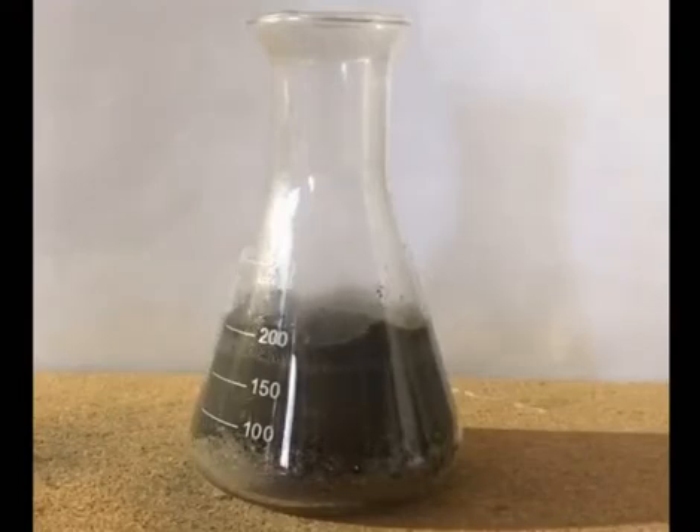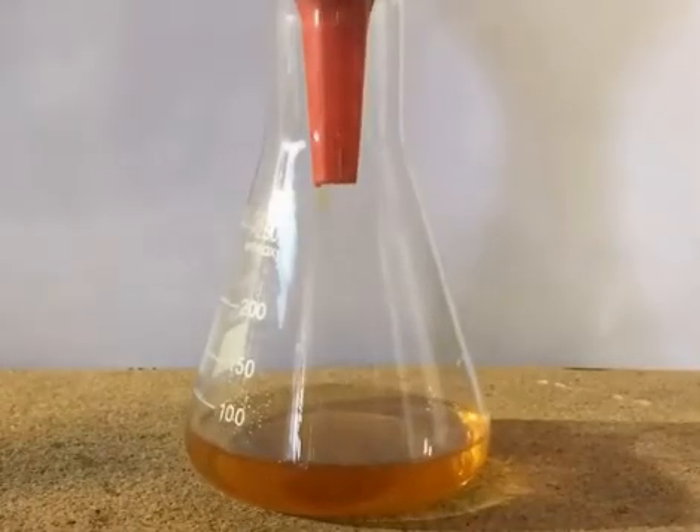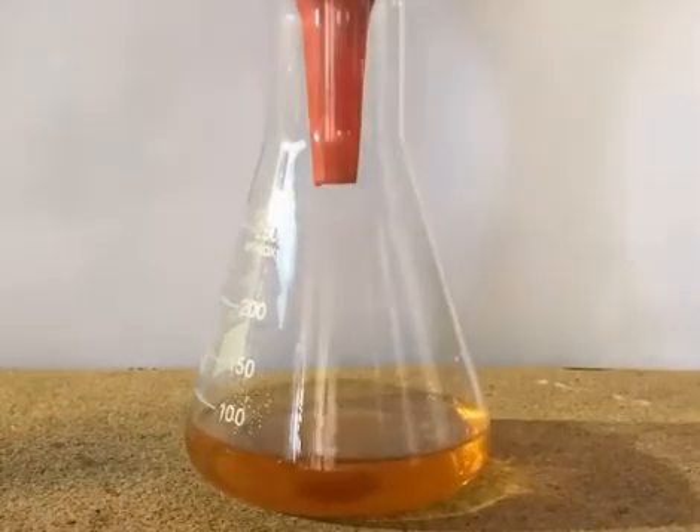So about 5 milliliters of concentrated hydrochloric acid are added to get the pH back to around 2, but this was probably unnecessary. The dirty liquid is then filtered to get rid of all the insoluble matter, and a clear orange solution is obtained.